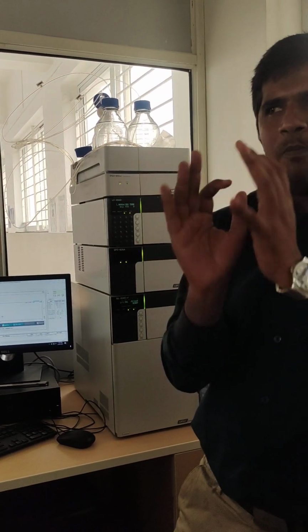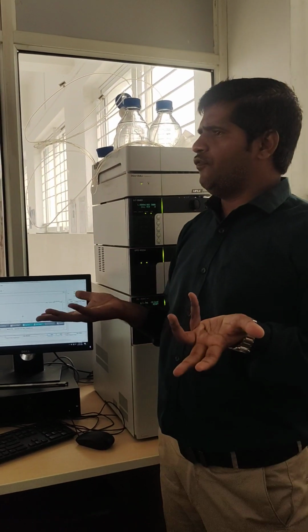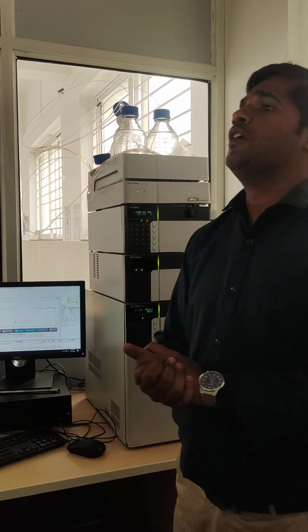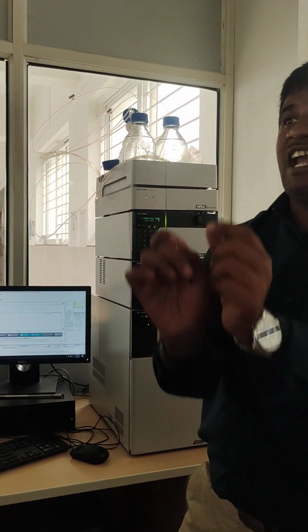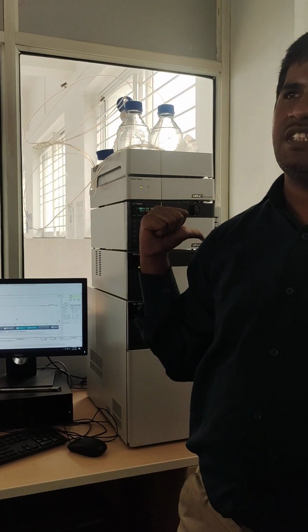Whatever mobile phase we are using should be HPLC grade. What is that? HPLC grade. What is the meaning of HPLC grade versus normal purity? Normal purity contains 99, 98, or sometimes 97%, and we can still call it a purified compound. But in HPLC grade, the purity is 99.9%. So that pure solvent we have to use here.